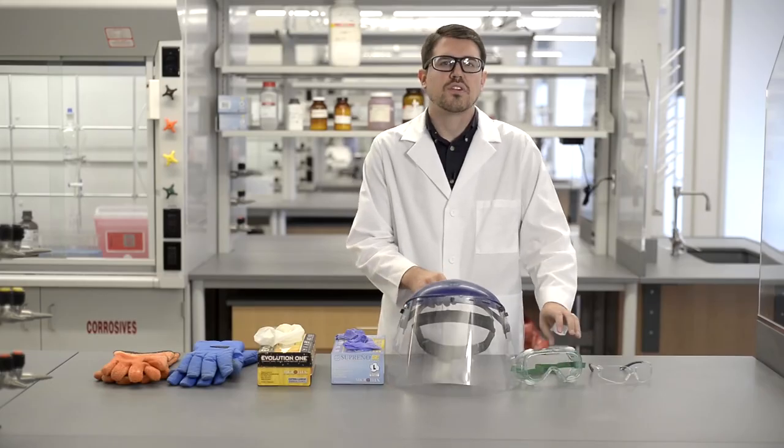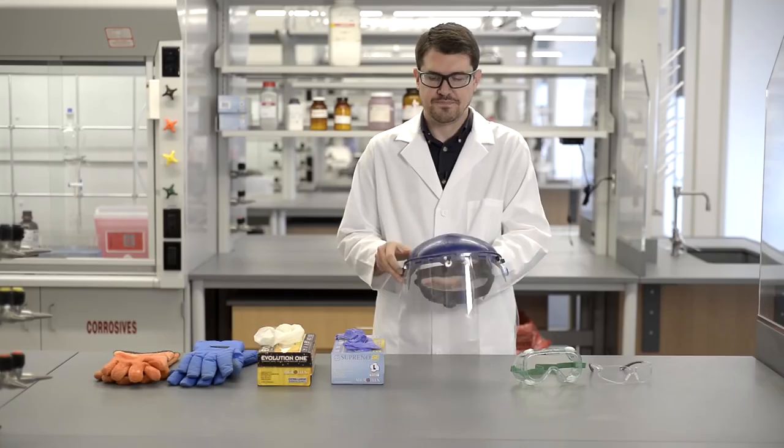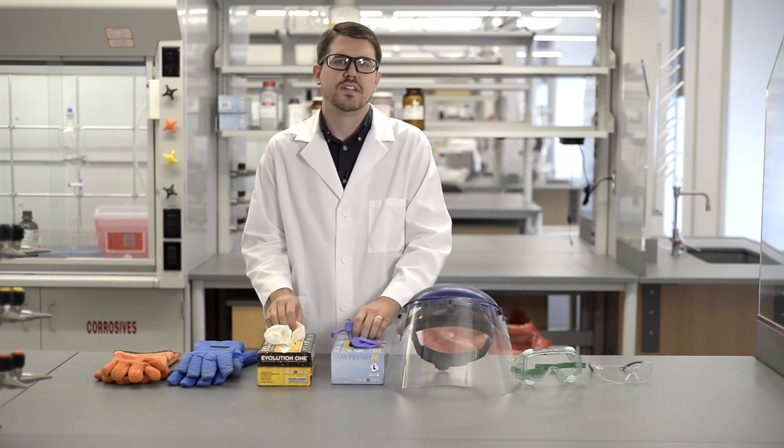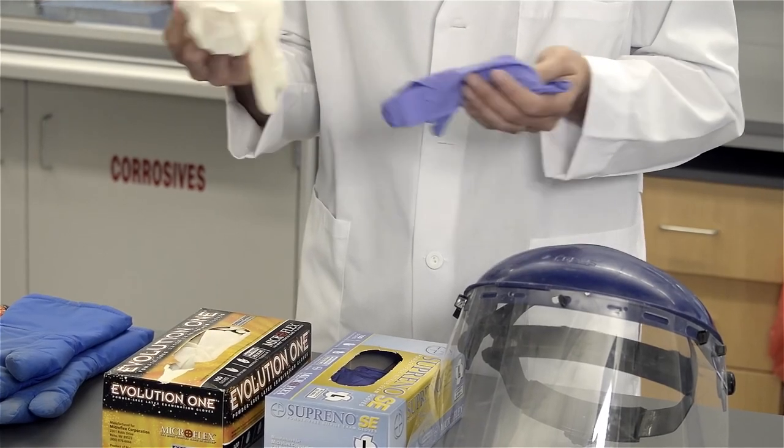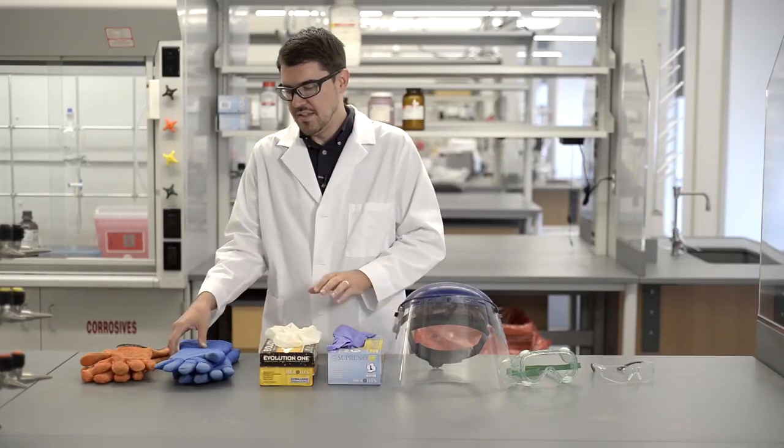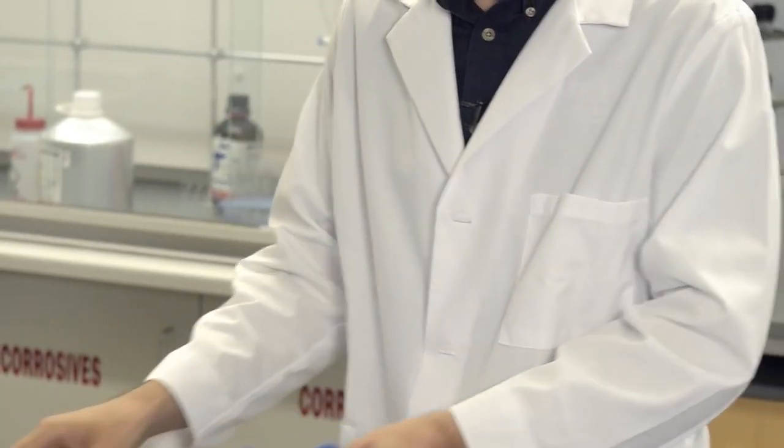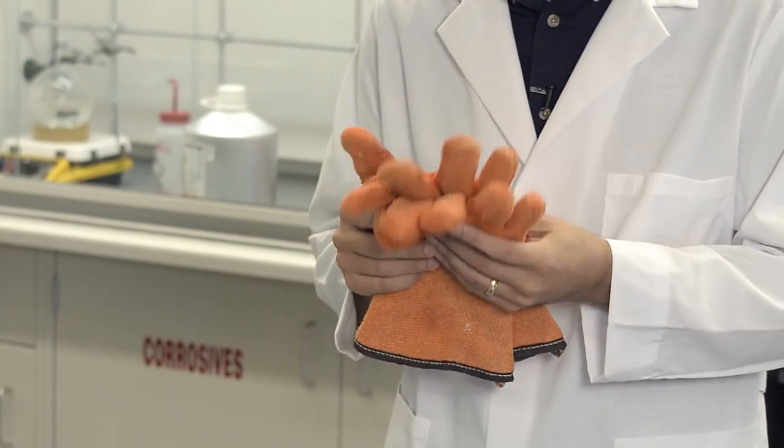If you're working with cryogens or any hazardous processes, then a face shield is required. Gloves also need to be worn at all times. They are made of many different materials. Please consult your MSDS to determine the appropriate type. Cryogen gloves are to be used when working with any type of cryogen, and autoclave gloves are to be used when working with an autoclave or any hot materials.